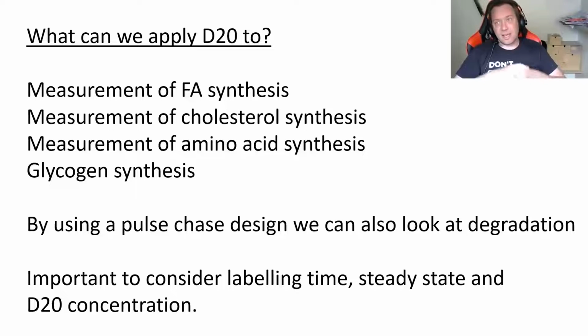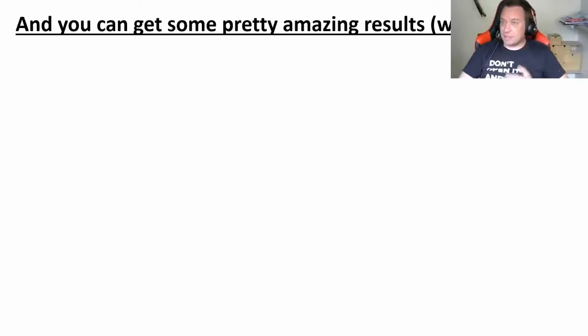And this is really, really powerful, but it is important to consider the labeling time, and we'll come to that in 2 slides, due to the issues of steady state. Also, you need to consider your deuterated water concentration to give you the optimal separation when you're doing mass spec. Okay, and in my opinion, you can get some pretty amazing results.